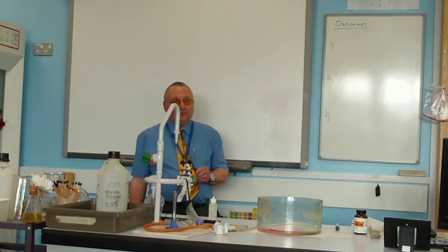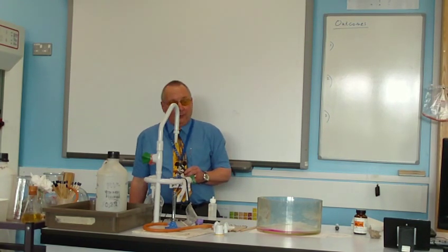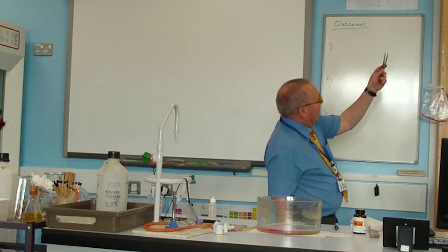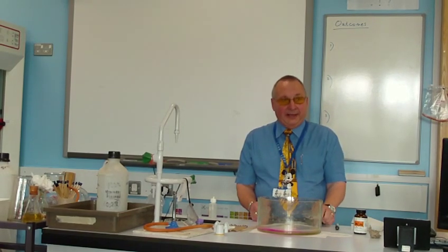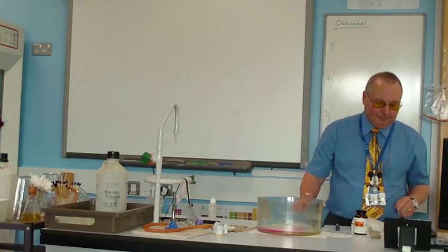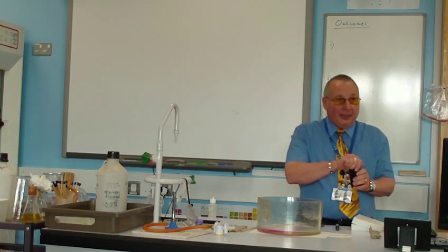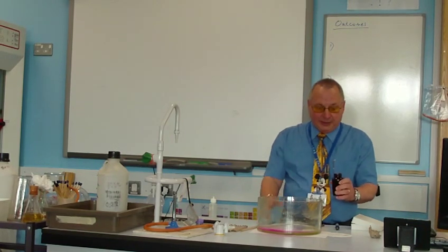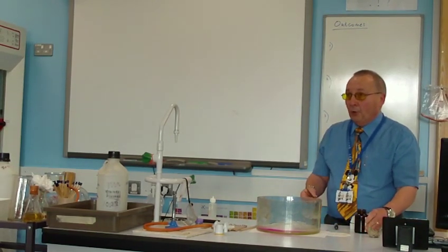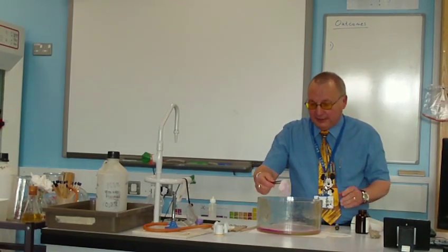Ooh. Oh, wow. Ooh. So do you think that was more reactive? Yeah. It was. So as I went from Li, lithium, at the top to sodium, it got more reactive. What's the symbol of the next one? After Na? K. That's potassium. Now, how reactive do you think that will be? Very reactive. More so, because as I'm going down, they're getting more reactive, yeah? In fact, I could get rid of this. I don't even need that now.